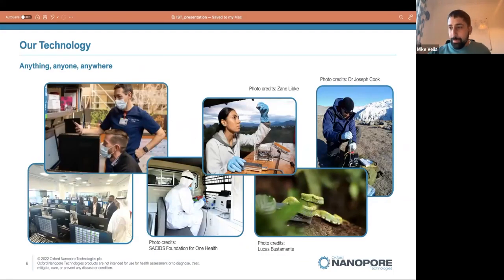So a DNA sequencer is a device which reads and records a sequence of nucleotides in a DNA molecule. One of the most advanced technologies currently available to do this is made by our company, Oxford Nanopore. This utilizes electrical means to measure DNA sequences. I'll talk in more detail about how this works, and I'll also describe how our competitors' technology works.